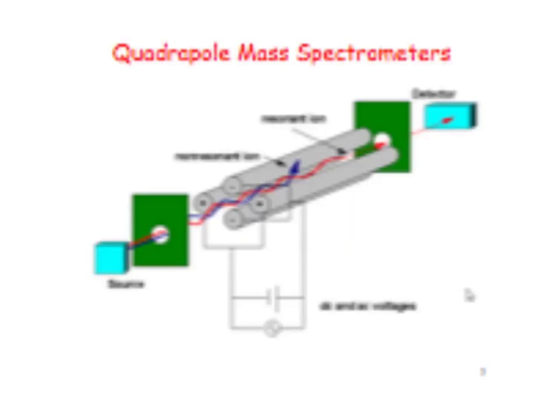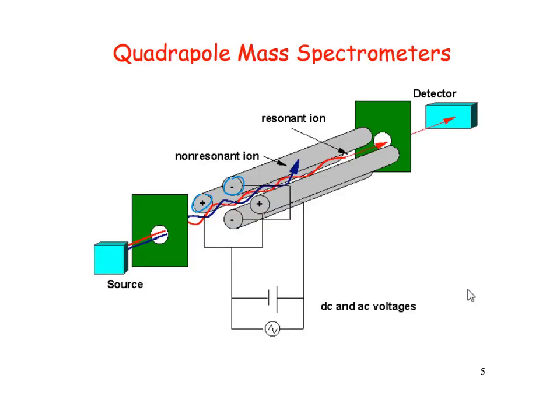All right, there are some instruments though. This is a diagram of what's called a quadrupole mass spectrometer. The way that this works, it essentially has these 4 rods, or poles, quadrupole. The ion source is over here. The ions are accelerated through this tube and down between these different poles. And the poles can have voltages placed across them, both direct current or alternating current.